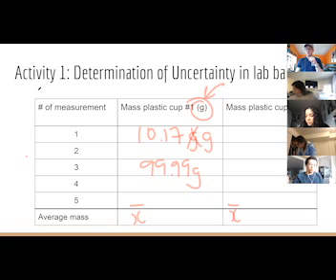And the other thing you should do, because right now I took my cup off and my balance says 0.11 grams. What should I do? Push the tare. Exactly. Tare it again. Because if I don't, that is an error I've put in there. That is a systematic error of my instrument that I didn't deal with.